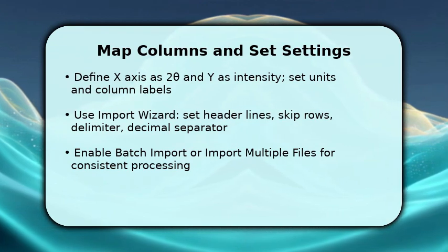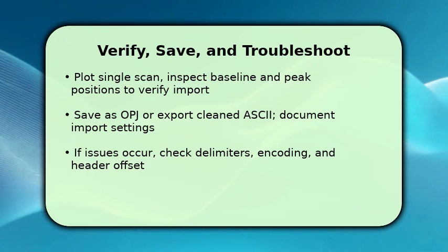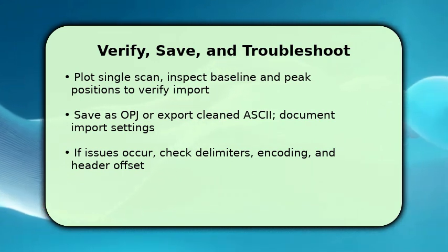Finally, verify imports by plotting a representative scan and inspecting baseline and peak positions so you confirm correct scaling. Once satisfied, save your workbook as an OPJ or export cleaned ASCII files and record the import settings for reproducibility.